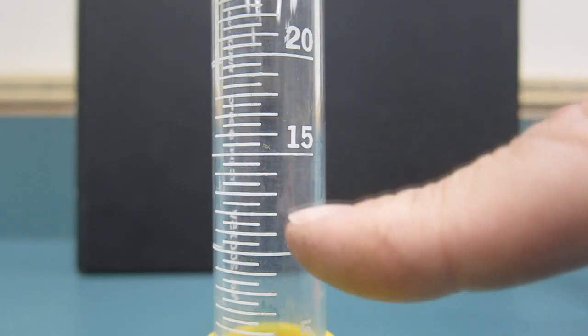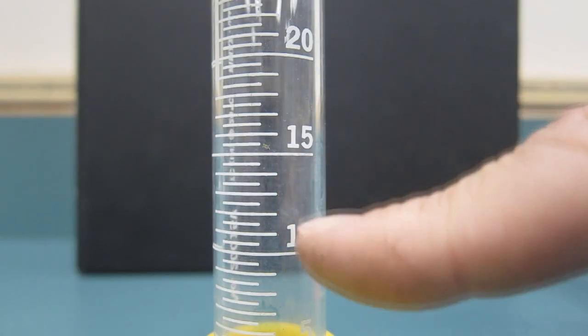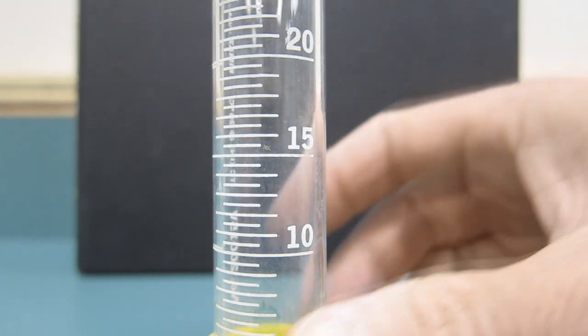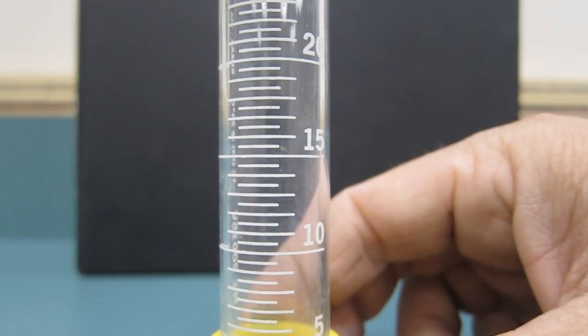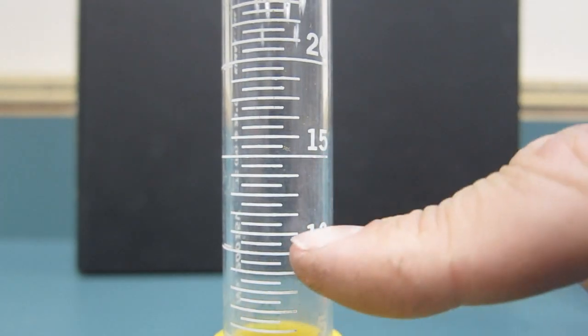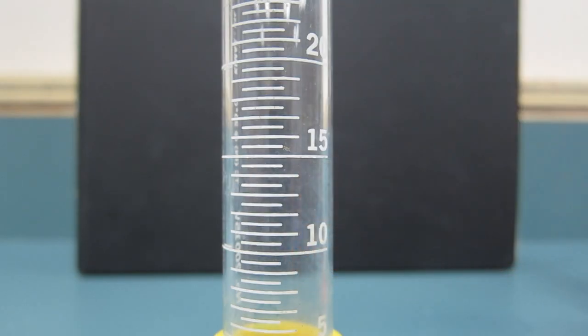So, a difference of 5 divided by 10 is equal to halves or 0.5. So, this is counting by 0.5s. And you'll notice they make the tick marks a little bigger here at the whole number.